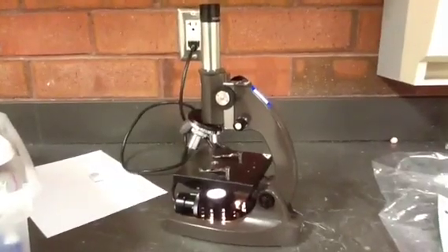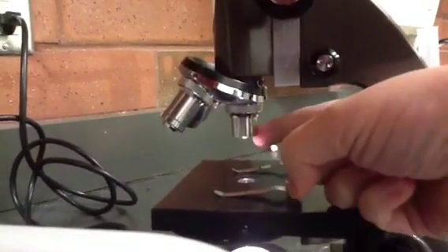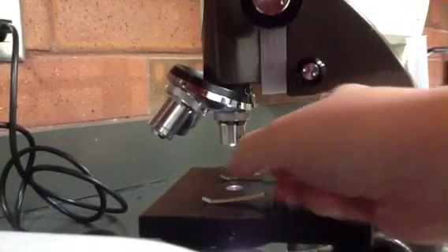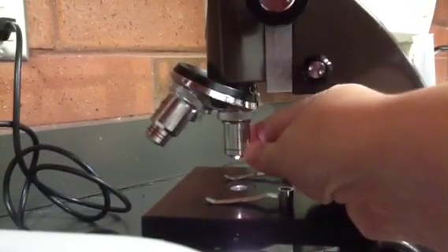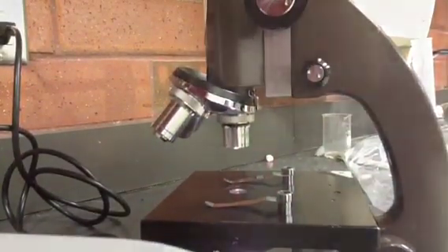The first step in using your microscope is to plug it in. You'll notice now that the microscope is plugged in, the light has come on. The next step in using your microscope is to make sure that it's on the lowest setting, which is the shortest lens. This is the 4 power. If it's not, you can rotate the lenses. You should feel a slight click when it goes into place. You always start out your microscope on the lowest setting.